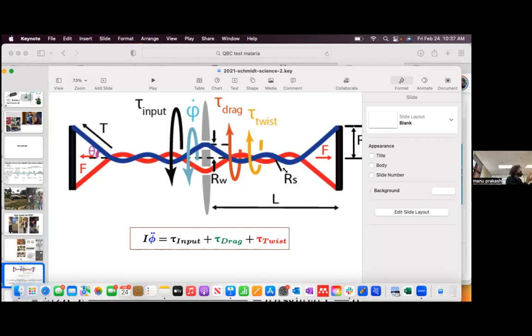So that's where that twist comes in. Tension in a twisted string gives rise to turns, right? Because when you're increasing the tension, you can turn force into torque. That's the first transfer function, because otherwise force doesn't turn into torque. I can pull as much as I want.